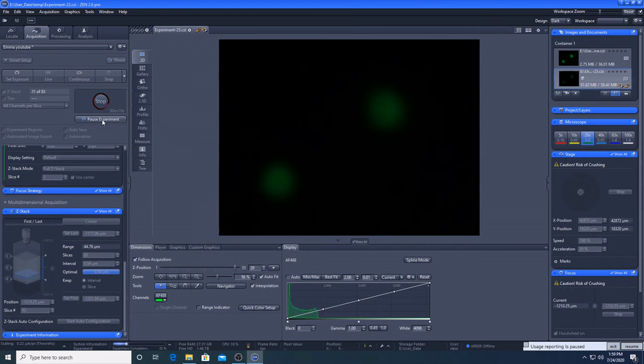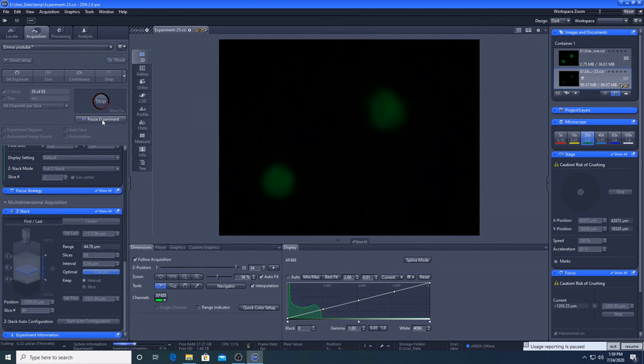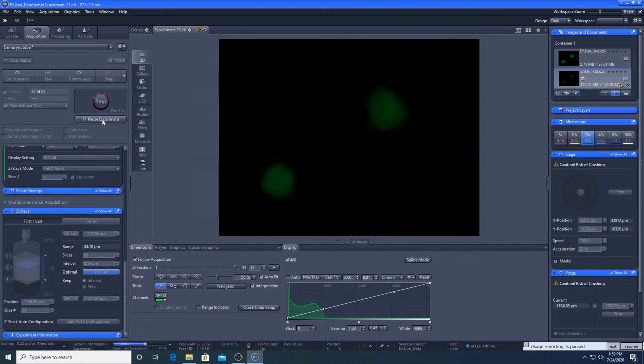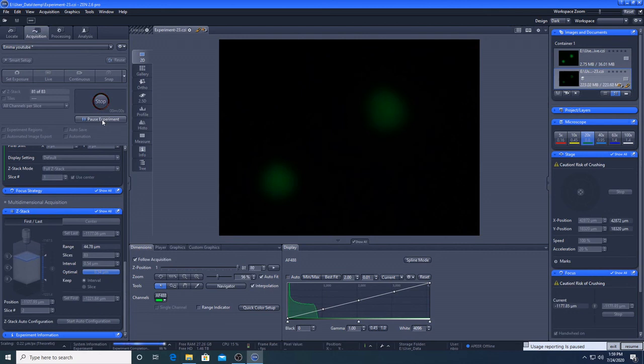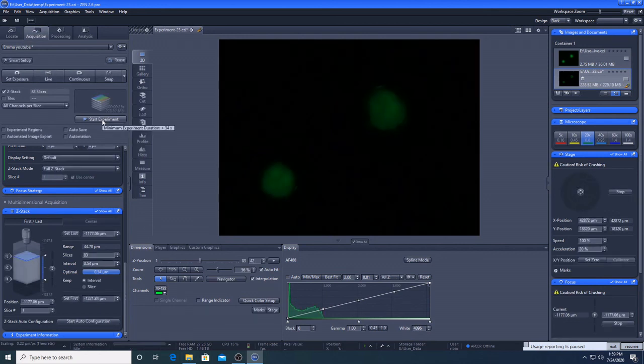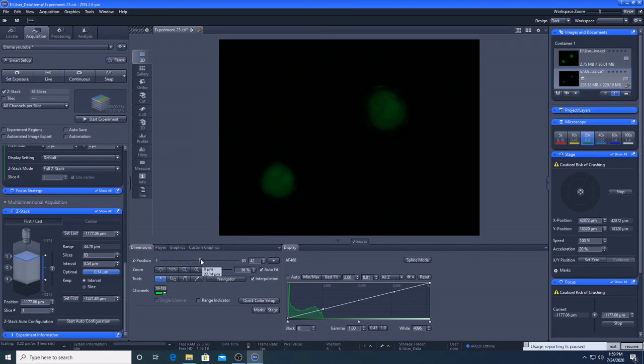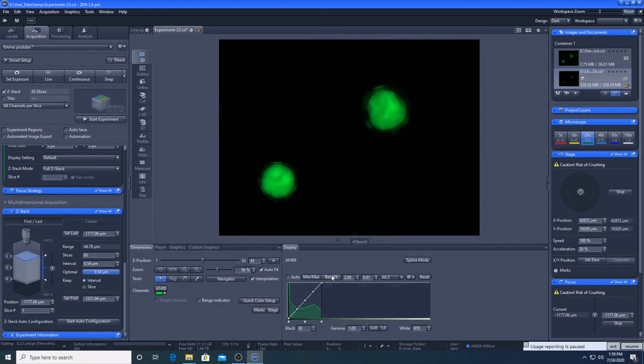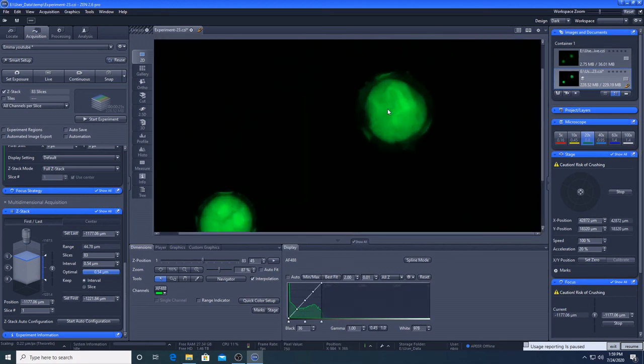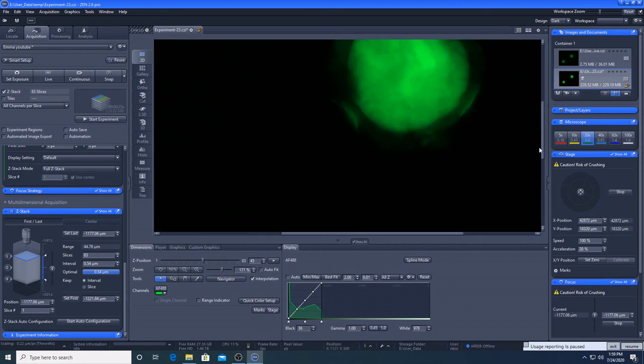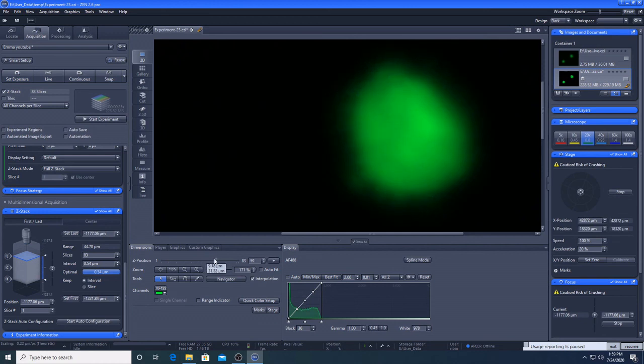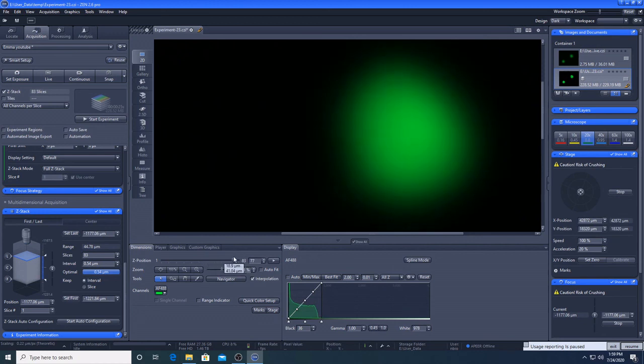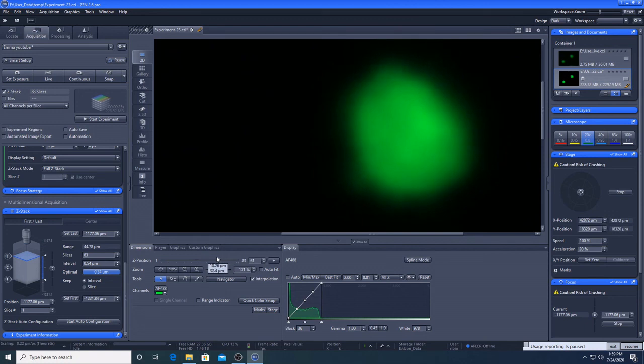So if I want to see my different layers I can use this bar here. It's a bit brighter and I will zoom into this one and I'll show you through the different layers. So I've made it too thick here. There's not really any useful information beyond this thing.